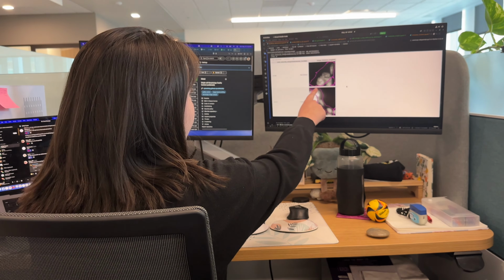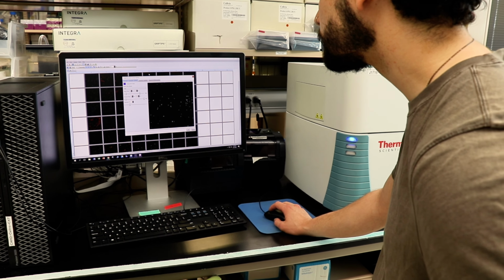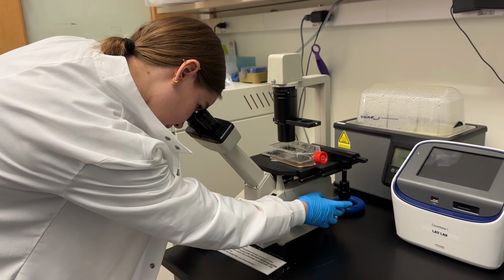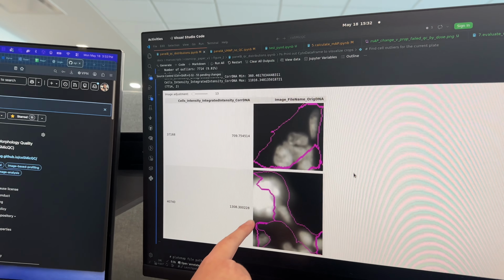For example, this is the cell segmentation here, and you can see that there are multiple different... Cosmic QC is a software package designed for quality control of single-cell morphology profiles. During cell segmentation, technical artifacts, debris, and erroneous segments can arise, which can lead to issues during our analysis. These issues can occur from many different sources. These can include microscope issues, contamination from dust or unwanted material, which can include maybe coughing on your samples, which sometimes happens in the lab.